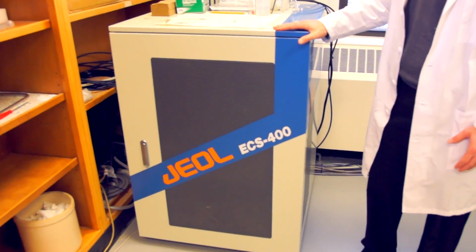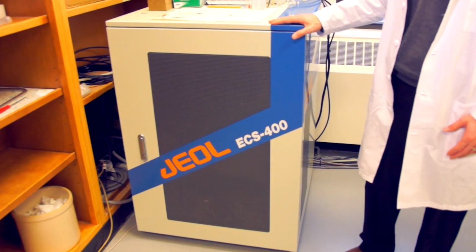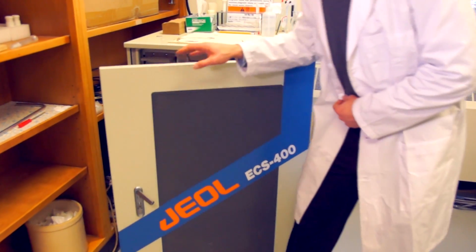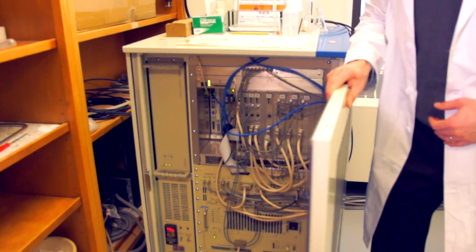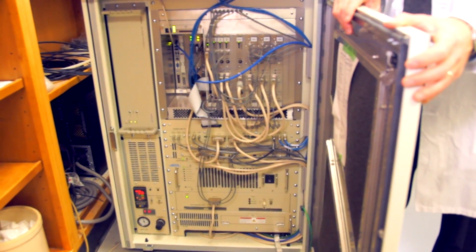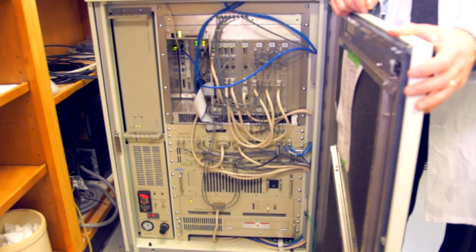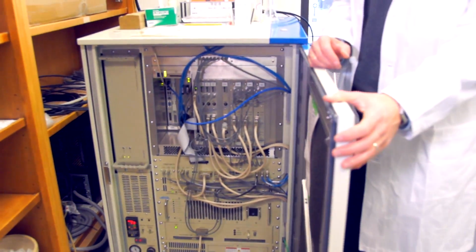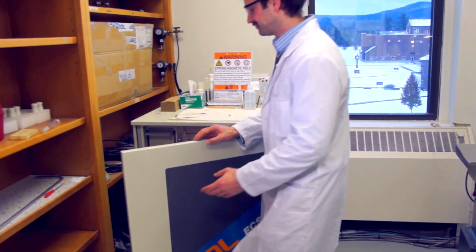A little less exciting of a unit, just a box, but inside that box we have quite a bit of electronic components. We can control temperature, we can have carbon NMR synthesizers, we've got a variety of different things that we can control to do a variety of different experiments.